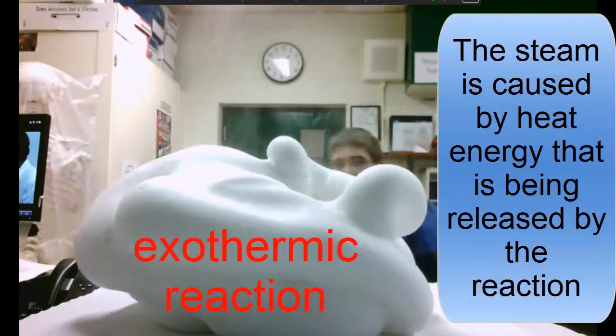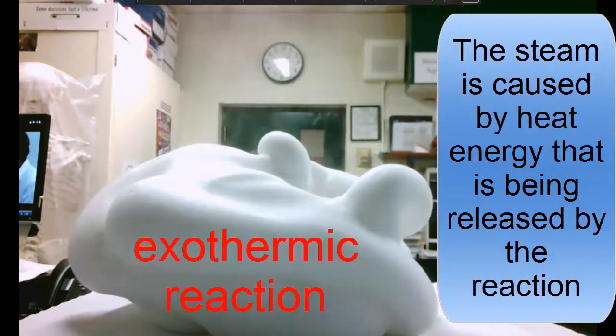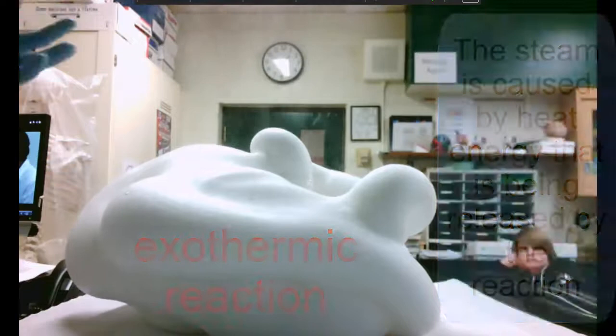The steam is caused by heat energy that is being released by the reaction because it is an exothermic reaction.